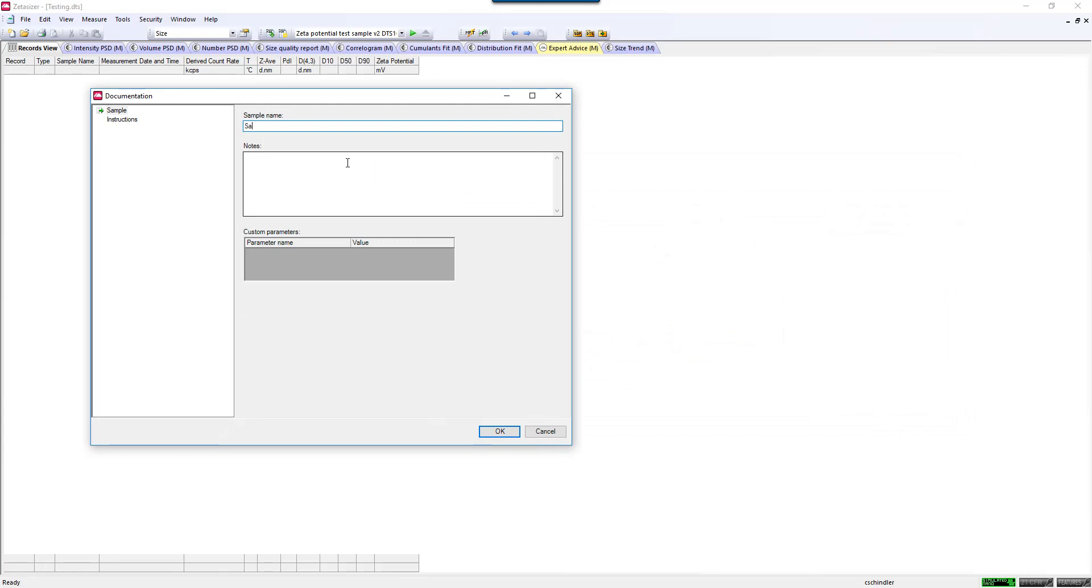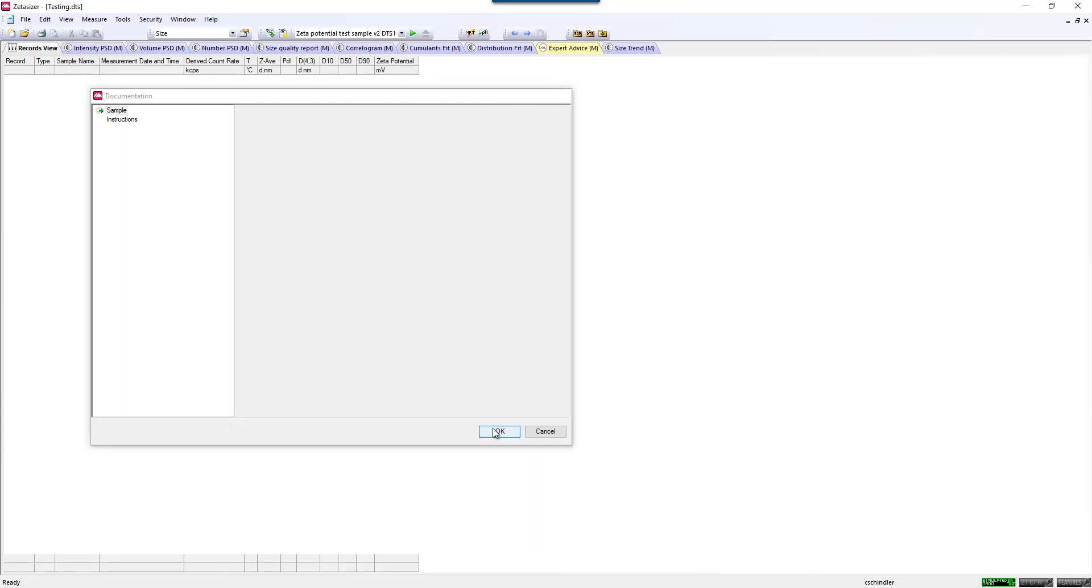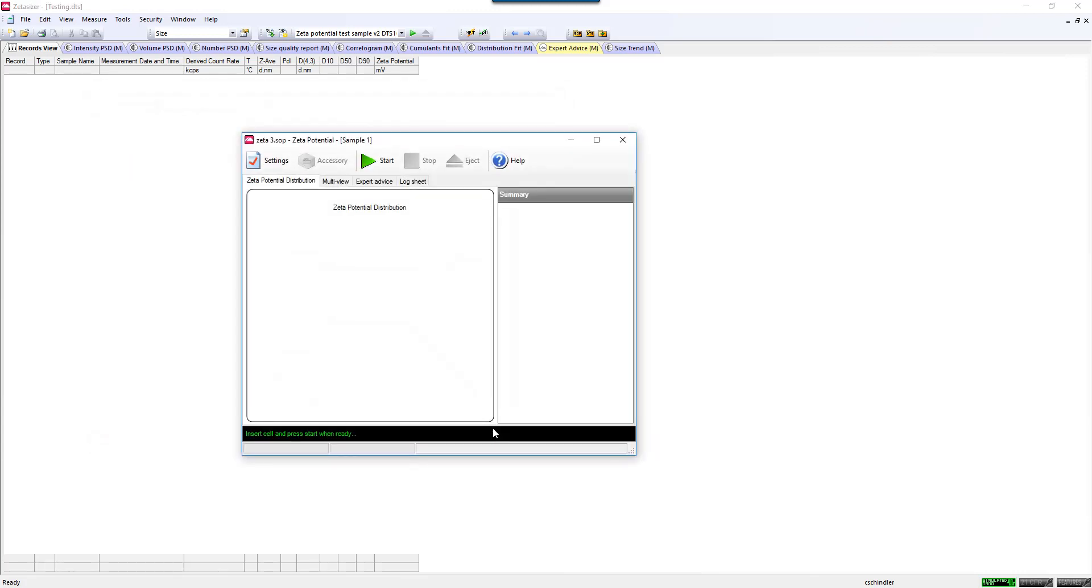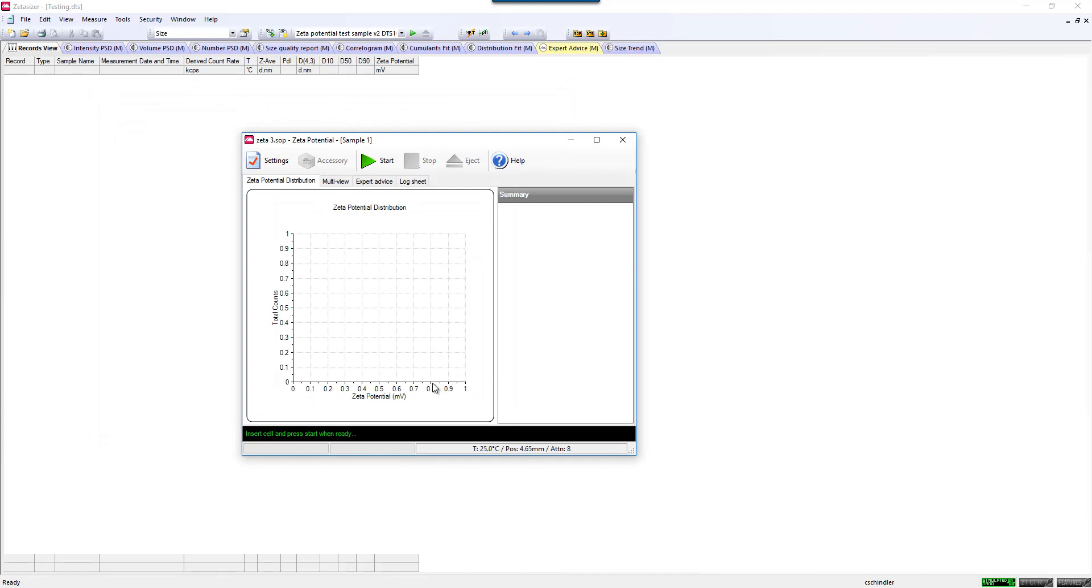Enter a sample name. Hit OK. Insert your cell into the instrument, making sure that you've inserted the proper direction as indicated on the box of the cuvette. And click Start.